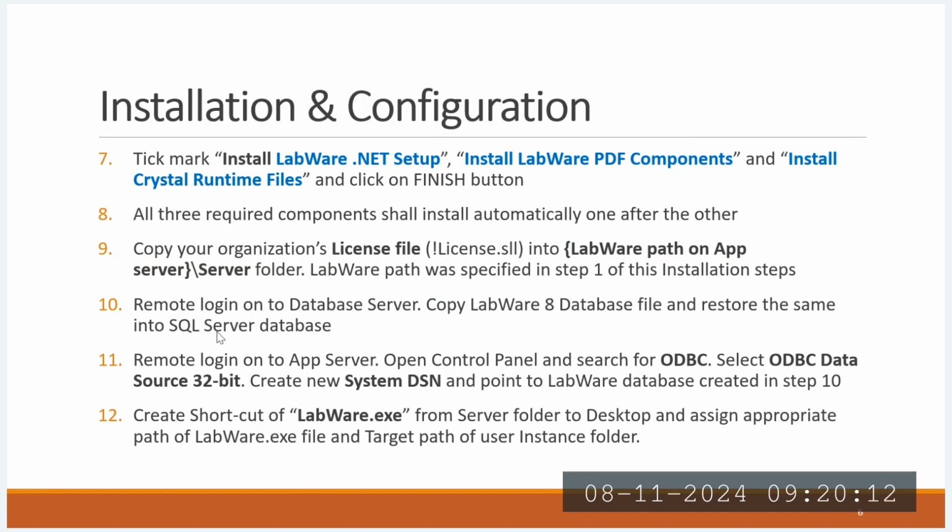LabWare LIMS application. Apart from this, there are some remote logins like database servers, application servers, and web-based servers. Those will be part of your database architecture activity. That will not be part of LabWare LIMS. If you have any idea about SQL Server or SQL database activity, you will come to know.